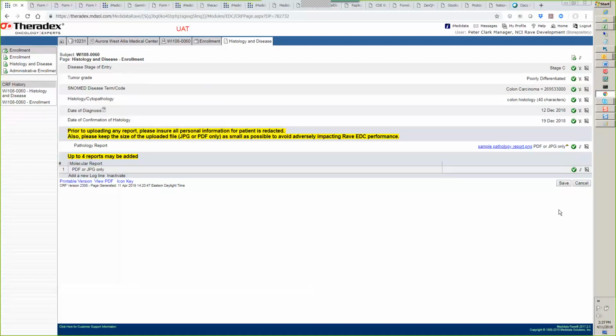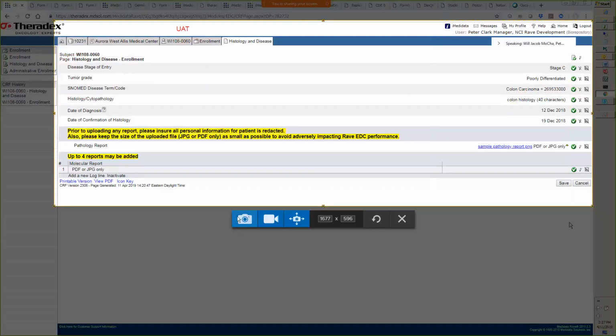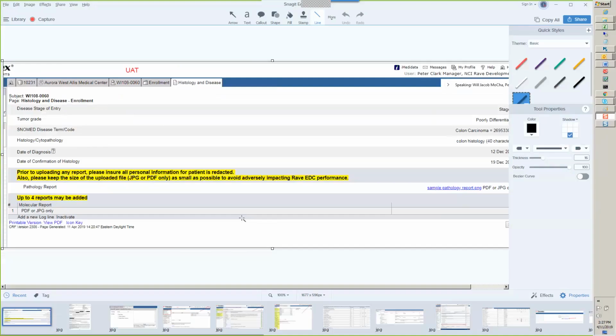This one is a molecular report. So that's a different question. Yes, nobody should have edit functions or edit options to anybody else's report, much less their own. So I would say please remove that capability. Yes, I will make sure that happens. And for a clinical report to be amended or edited, if it's already been signed, it has to be done as an amended report. So it's a completely separate document. You can't go back in and just edit it and change it.